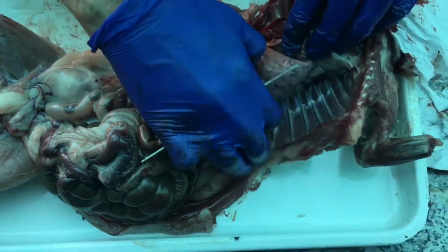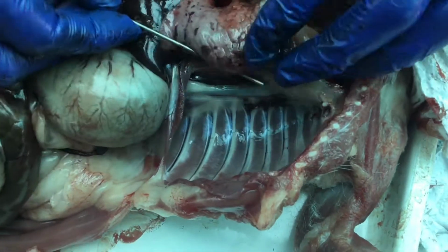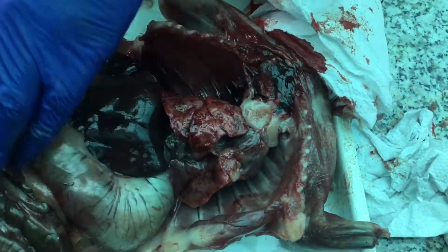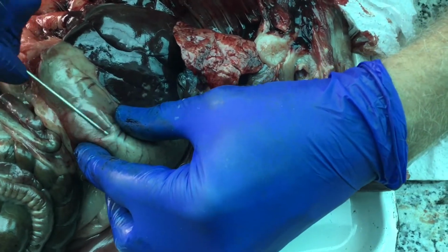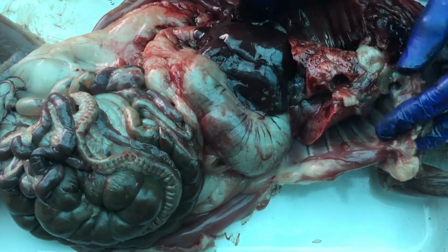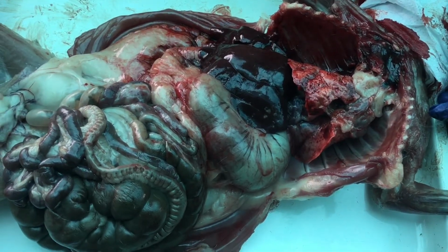And in fact, in the chest, I can even see back here how the saran wrap layer comes out along the midline and then covers the lungs. And so now it becomes visceral, covering the lungs in the chest cavity, covering all of the intestines, the stomach, and liver and everything in the abdominal cavity. It's very hard to pull off of the organs, but it's now visceral peritoneum down in the abdominal cavity, visceral pleura covering the lungs. And that then is my basic organizational plan of a mammalian body, including a human body.